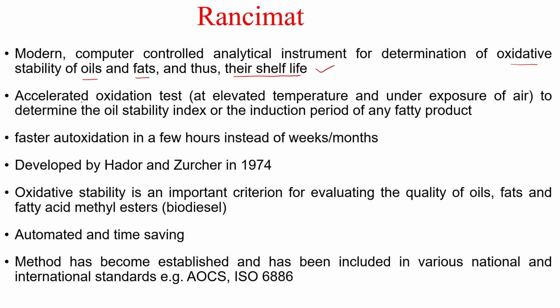Now it is the accelerated oxidation test, wherein we are providing the elevated temperature I have told you, and also under the exposed air condition, that is increased airflow we are providing, so that the oxidation which otherwise would have taken years to complete will be completed in a couple of hours, and we will be able to obtain the induction period of the fat, and ultimately the shelf life by extrapolation software, as I have told you, to determine the oxidation or the induction period of any fatty product.